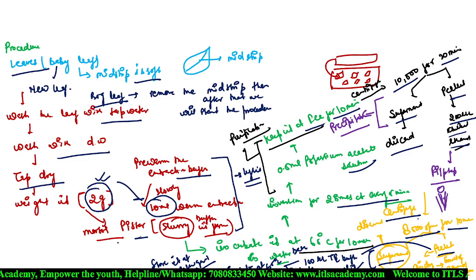Okay, ma'am. Ma'am, I have one more doubt. In DNA isolation, in theory, what I have studied is the phenol chloroform method and all. So, ma'am, why is this so different? This is another type of method for the isolation of DNA. You can also use that method. In our laboratory, we use this method for the isolation of DNA. Okay, ma'am. Anything else?